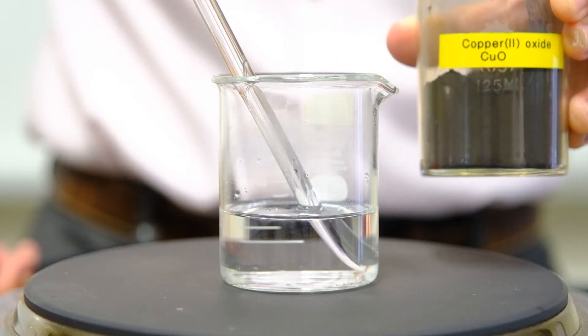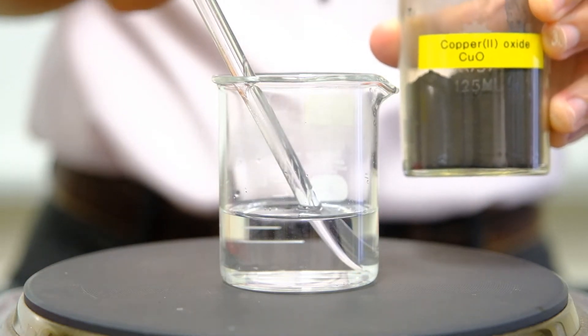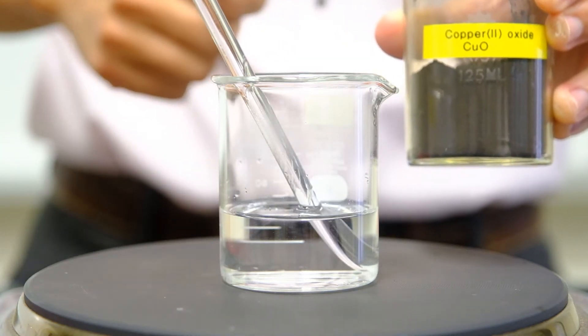Next, I'm going to add the copper-2-oxide into the sulfuric acid — spatula by spatula, followed by stirring with the glass rod to ensure good mixing.